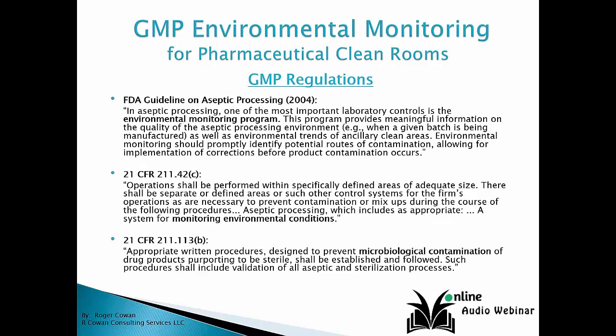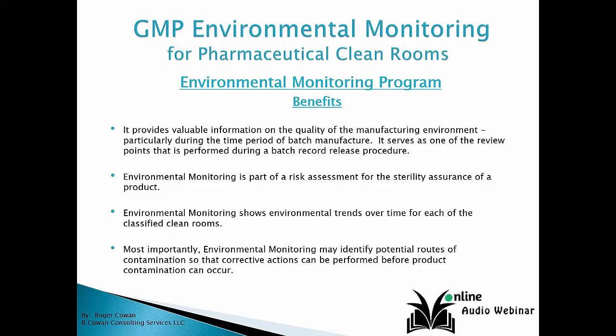So let's look at a few of the GMPs that apply to this. The FDA Guideline on Aseptic Processing came out in 2004. Another couple of GMP references here: 21 CFR 211.42, and another GMP reference, 21 CFR 211.113. Those GMPs discuss the need for an environmental monitoring program. Here are some of the benefits of such a program.